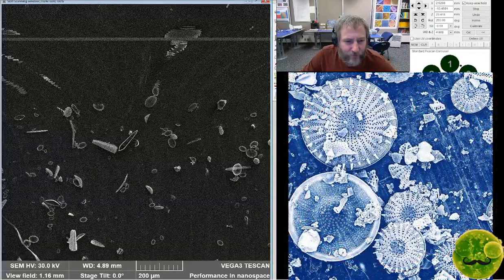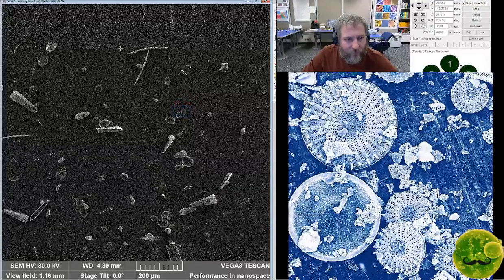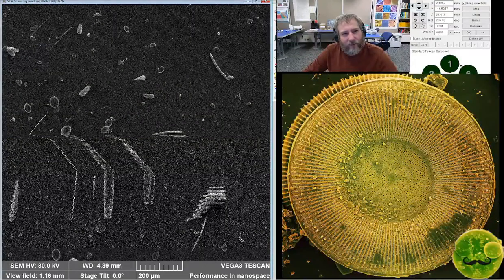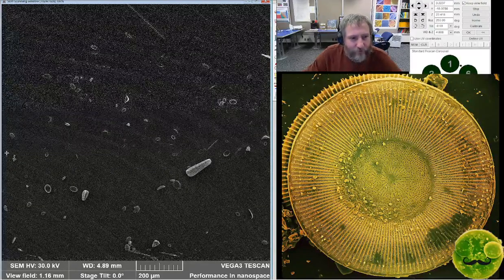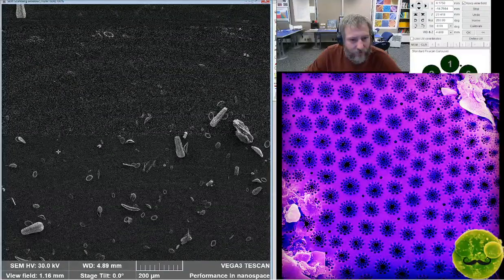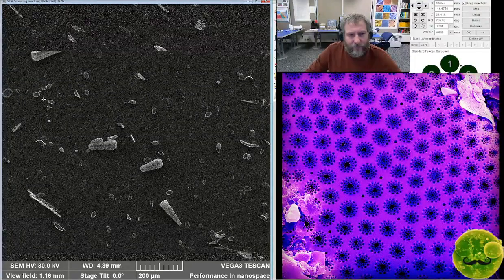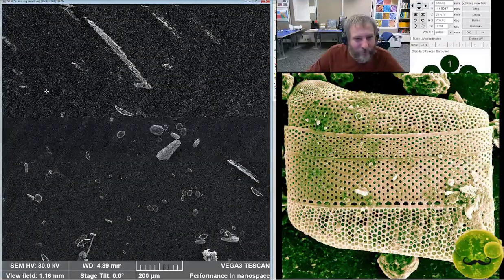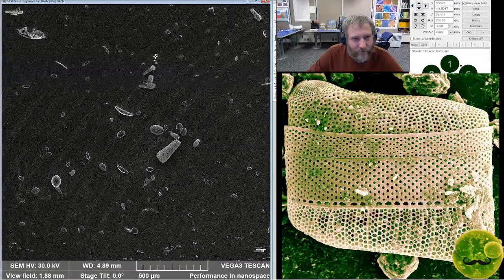See if I can find a clean one that doesn't have junk in the center area. I can't remember the name of that species off the top of my head. For some reason I always blank on the name of that one. It's like Kilomai, Africana, and this one. They kind of go together as a group, all three of those little weird guys. There's another one up there, girdle view.